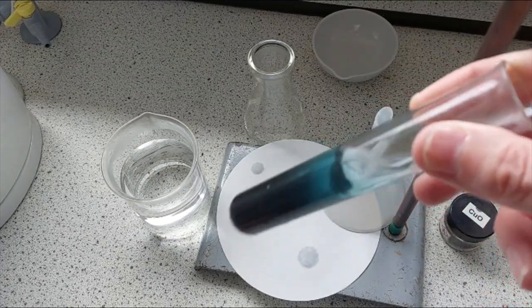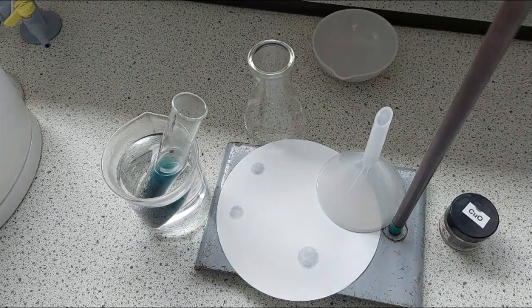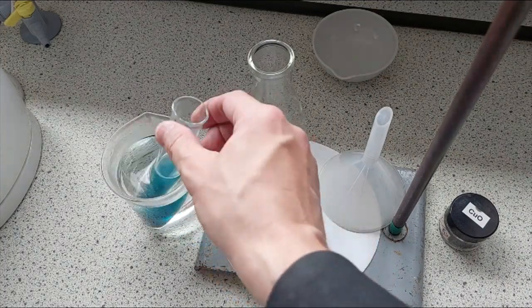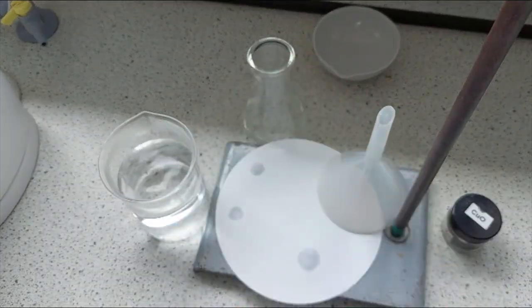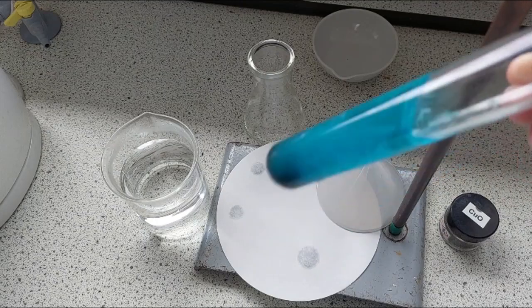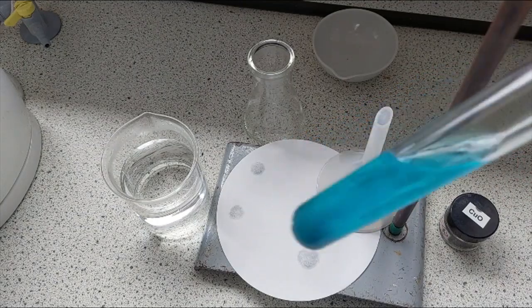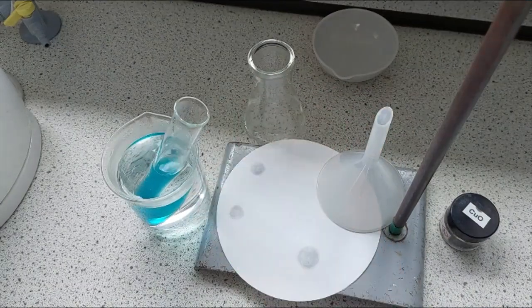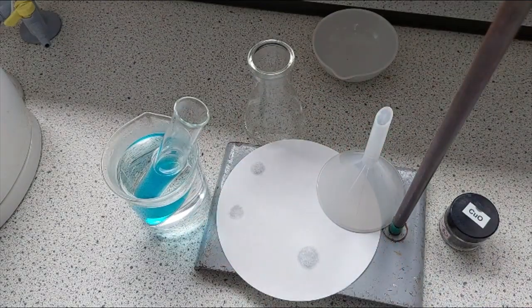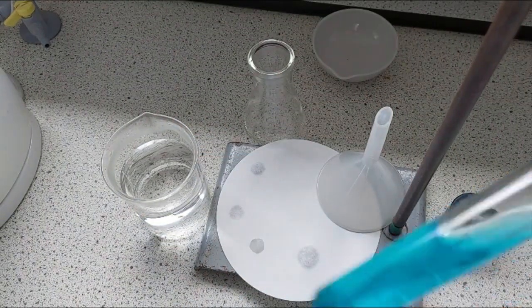What we want is for all of the black copper oxide powder to react with the sulfuric acid. We need the sulfuric acid to be fully reacted, because the second stage of this experiment involves evaporating all the liquid away to leave behind the salt as crystals. Now, if there was still some acid inside that boiling tube, sulfuric acid would evaporate, I could inhale it, and it could damage my lungs. So I have to make sure it is fully reacted.